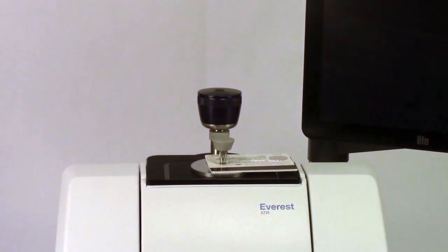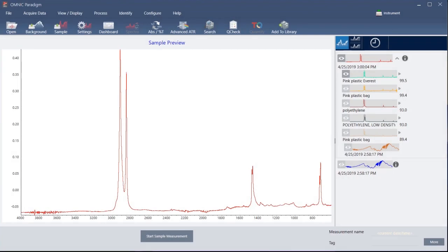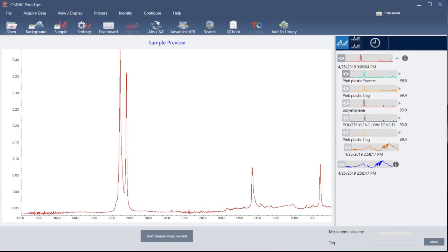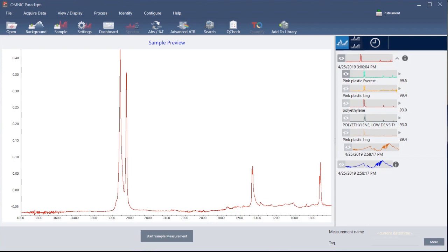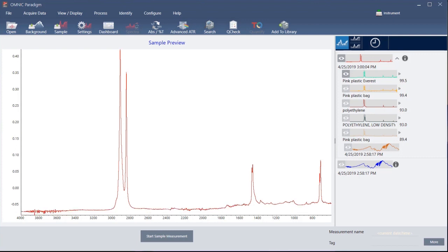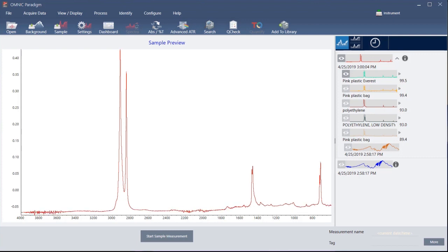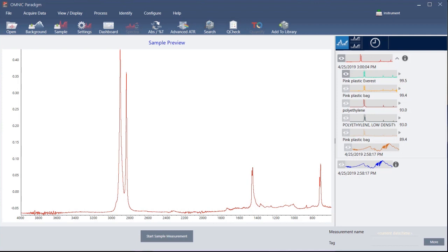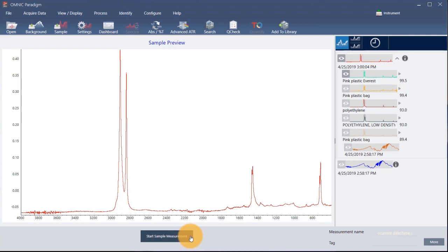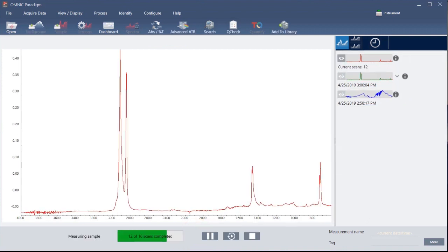For this demonstration, we are measuring a piece of plastic. Once a sample is in place, the spectrometer scans the sample and the software shows a preview of the acquired data in the spectral pane. If the peaks in the preview spectrum are very small, try repositioning the sample on the ATR crystal and then reapply pressure. When you are ready to start the sample measurement, click here and wait for the progress bar to complete.